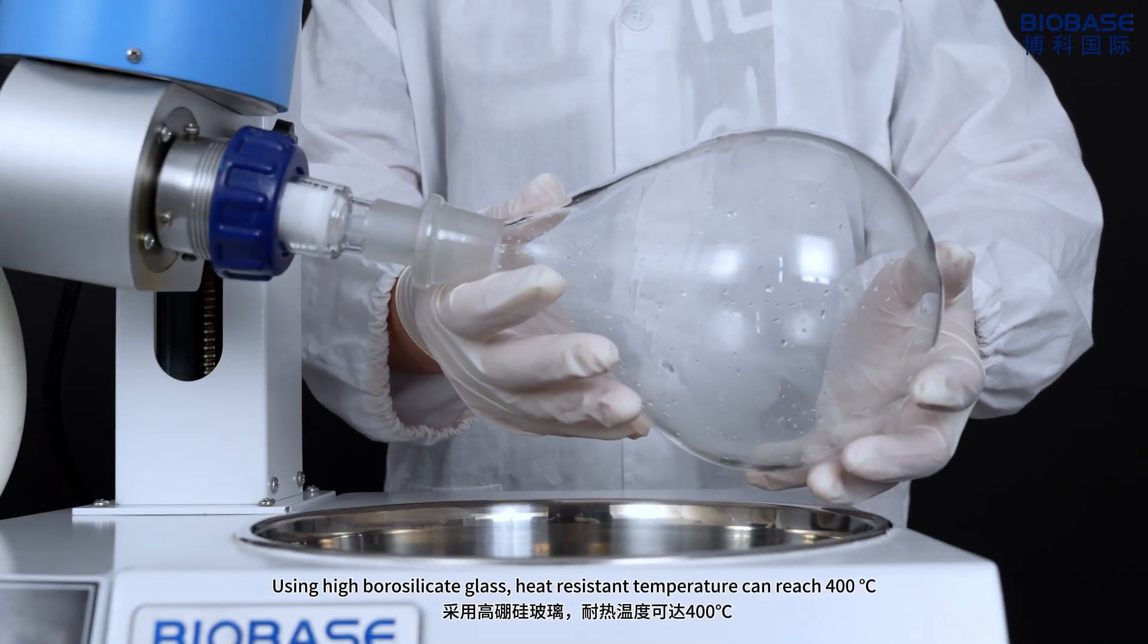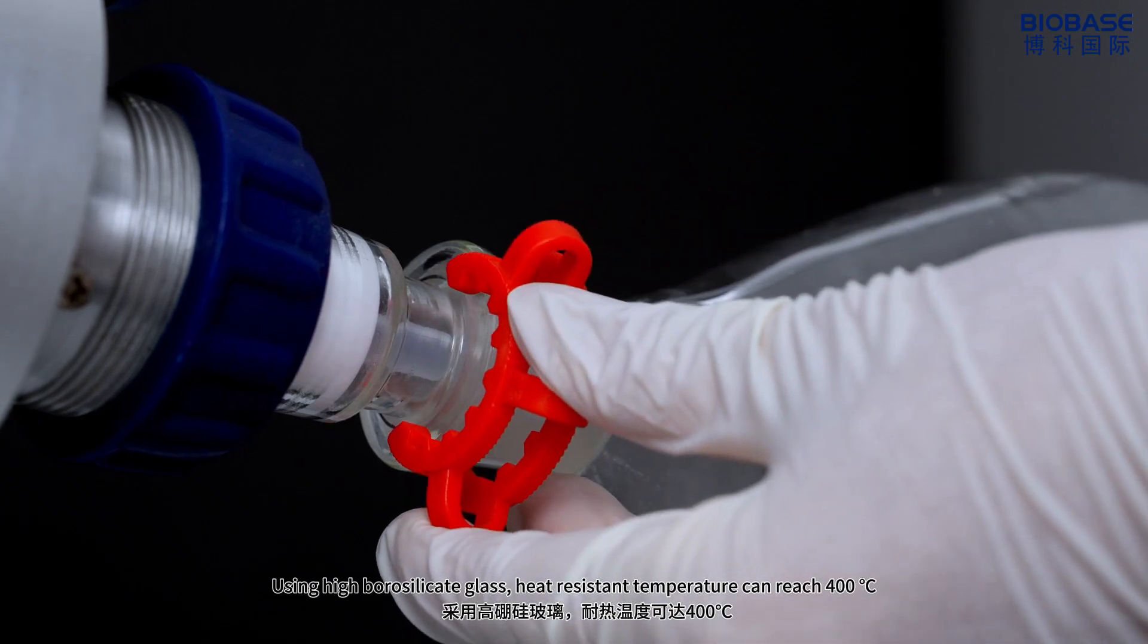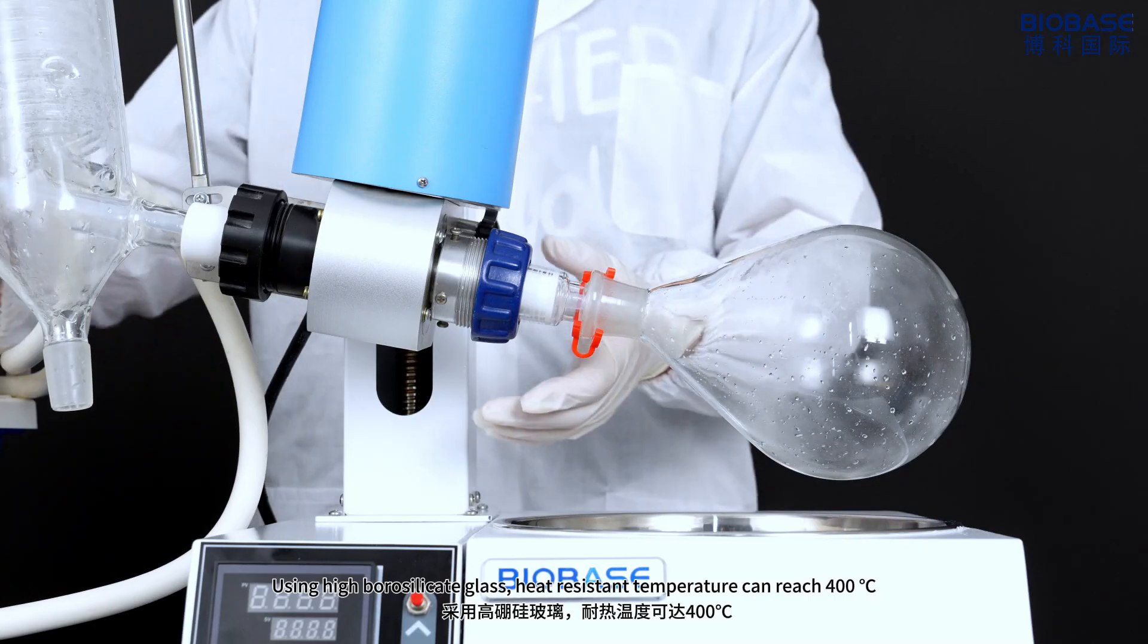Using high borosilicate glass, heat-resistant temperature can reach 400 centigrade.